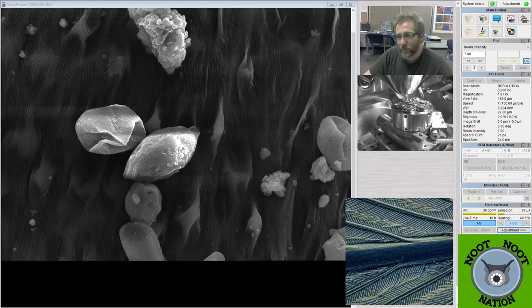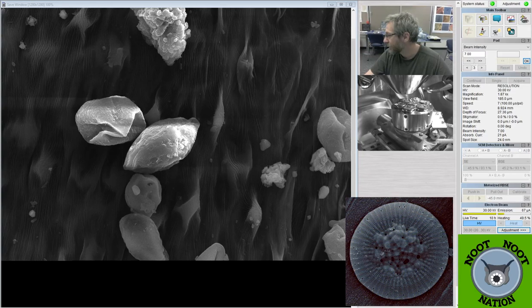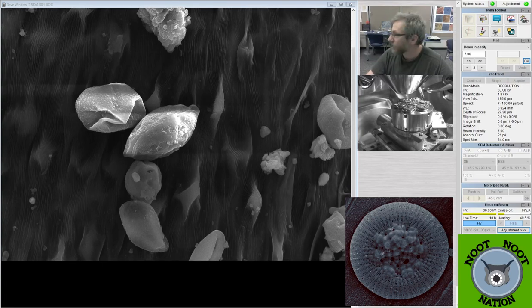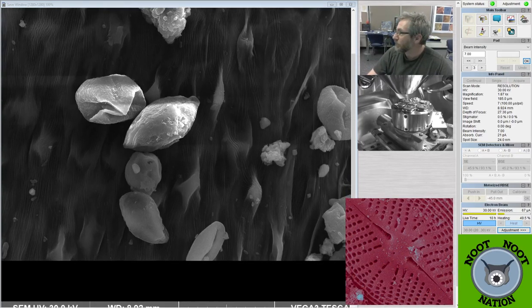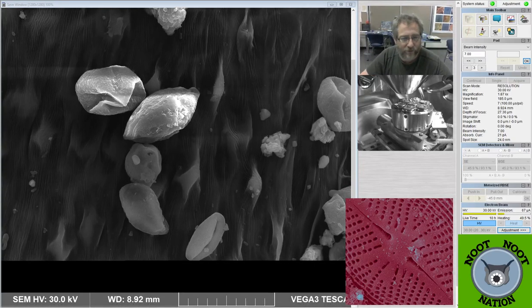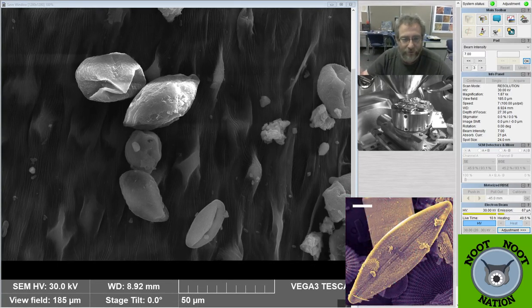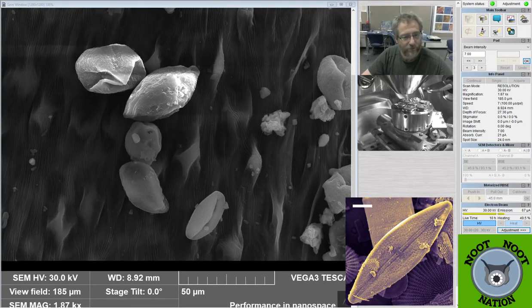She brought you some pollen from some wildflowers. Yeah. So I have violets, redbud, spring beauties, maple, some leatherleaf, some locust and oak buds, and phlox as well. Phlox is actually one of my favorite flowers to image. They're very pretty, a sort of pink color, with a yellow part in the middle where the pollen is. So I'm looking forward to seeing those.